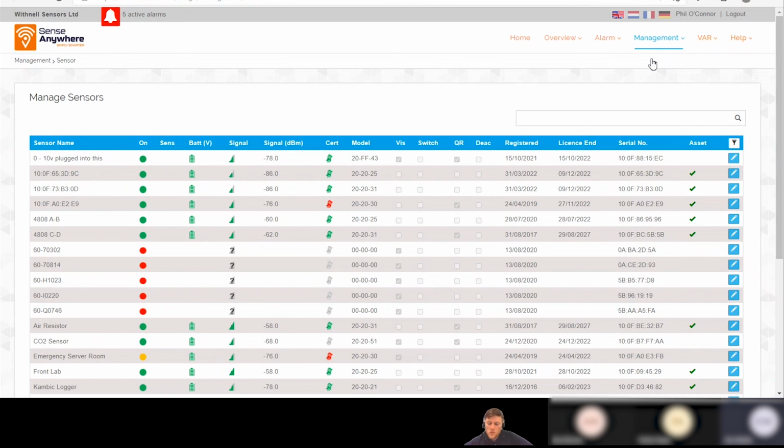Yeah. Just one other question I had then, Phil, was in terms of the calibration, so the annual calibration that would be done on the actual probes themselves, is that possible? So with ourselves, we calibrate our Veritex, and we get you guys over to do our validators for us. But is it possible for us to do calibration of the SenseAnywhere units?